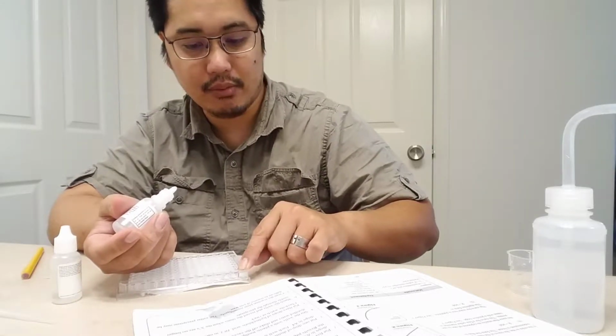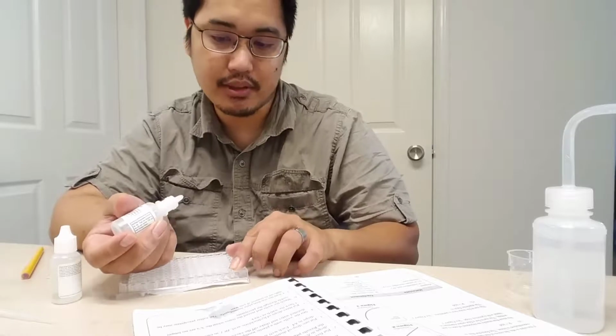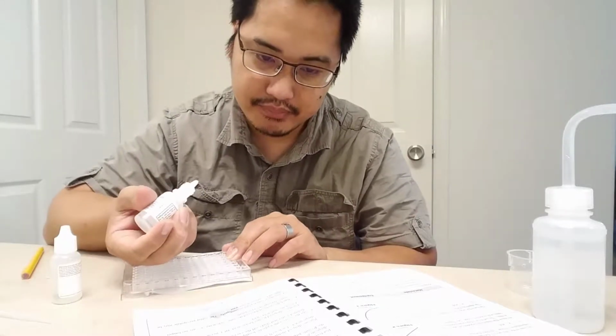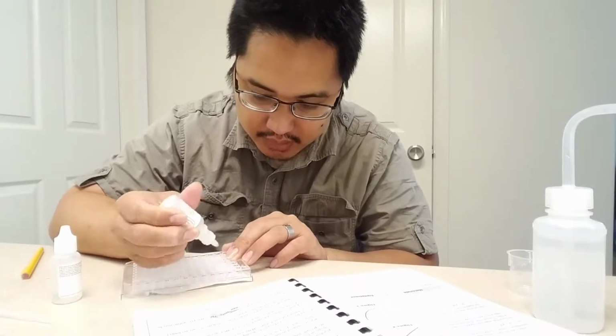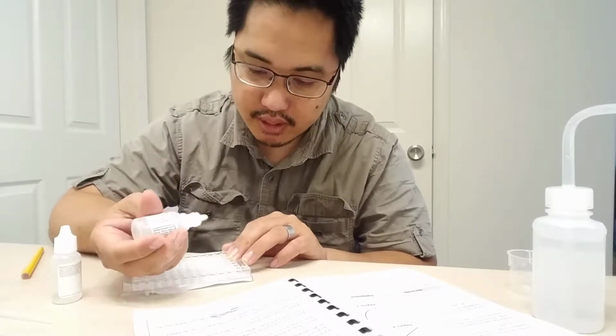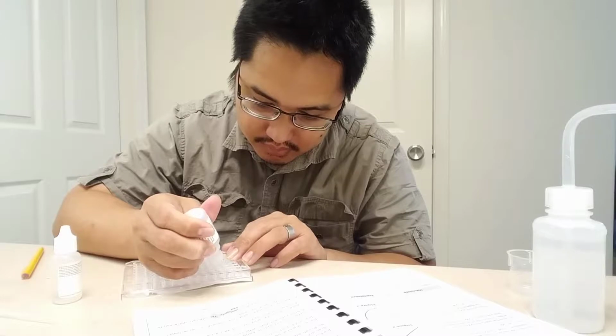All right, I know I have pure sodium thiosulfate in well number 1. Over here, I only have 4 drops, so I need to put 1 extra drop in there. In well A3, I only have 3 drops, so I need to put 2 extra in there.